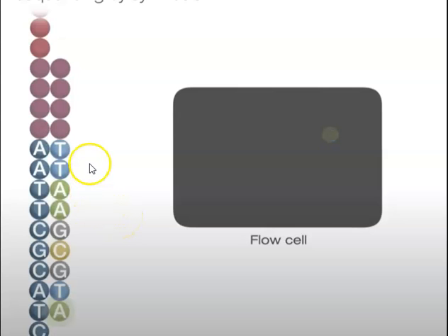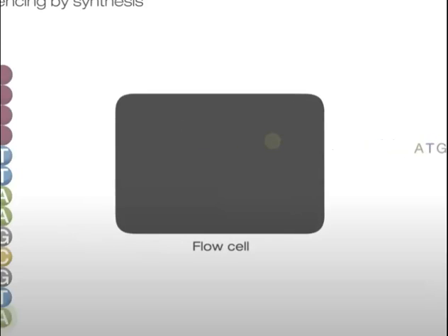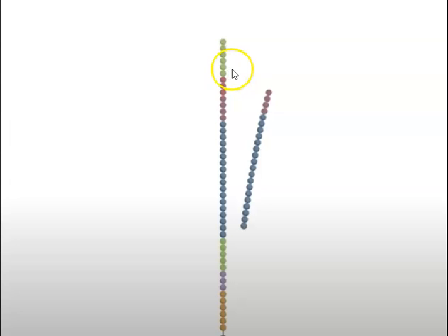So after sequentially adding in nucleotides and allowing DNA polymerase to extend that, we keep getting little flashes from this part here, this part of the flow cell, and we can start accumulating data for what that sequence is. And the sequence is accumulated from that particular sequence. So if you just move that back across, that's a sequence that's been generated coming from that sequence there. Okay, so we have read this piece of DNA, we've generated this piece of DNA and we've sequenced it, and that's why it's called sequence by synthesis, because as we sequence the DNA, we effectively read the sequence.